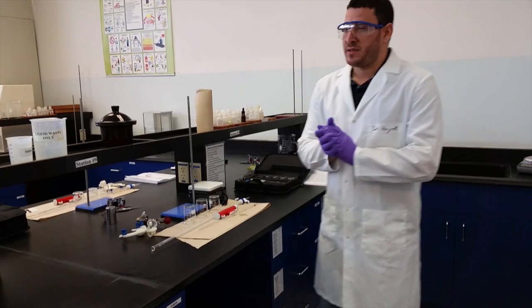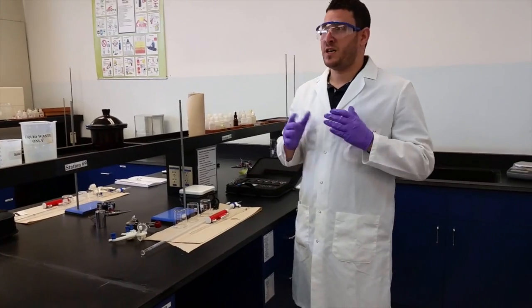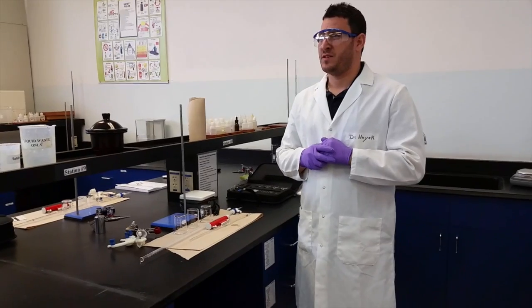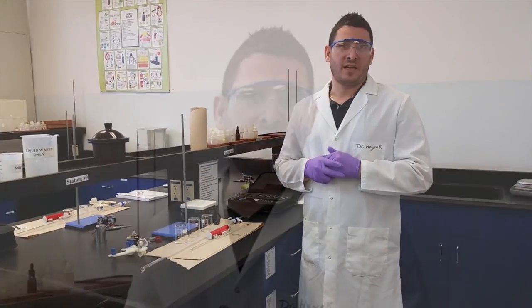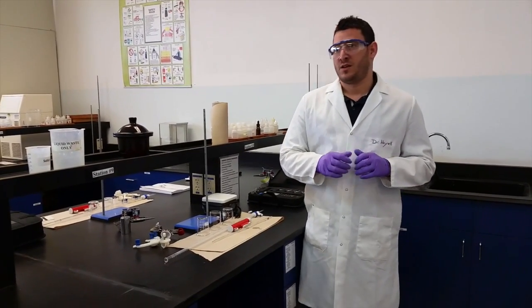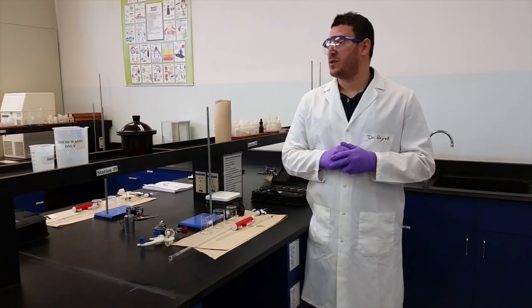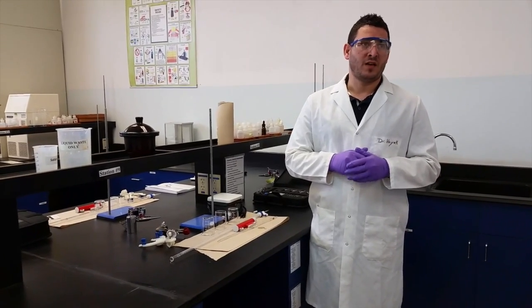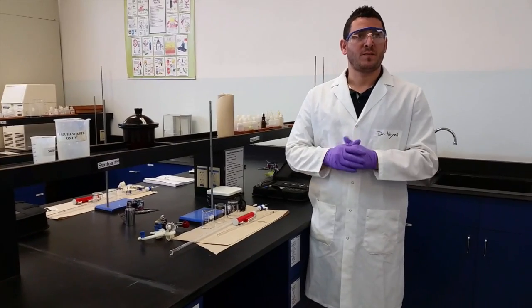So today's experiment is an experiment that you have done before. I remember it's experiment 5 in trimester 1. That's an acid-base titration. The difference is that in experiment 5 you did the qualitative aspect of it, where you used an indicator. So the end of the titration, you know it by the change in color, which was phenolphthalein, and it goes from colorless to pink.